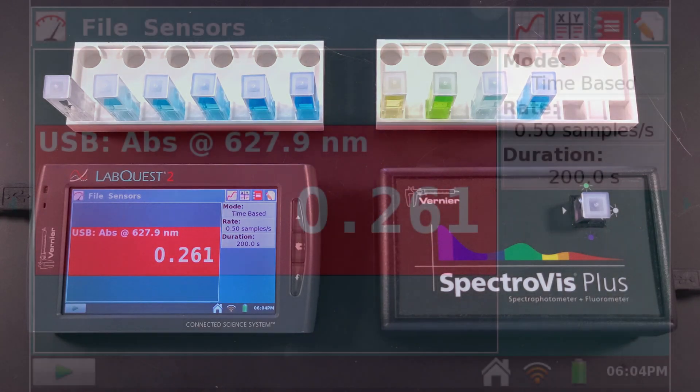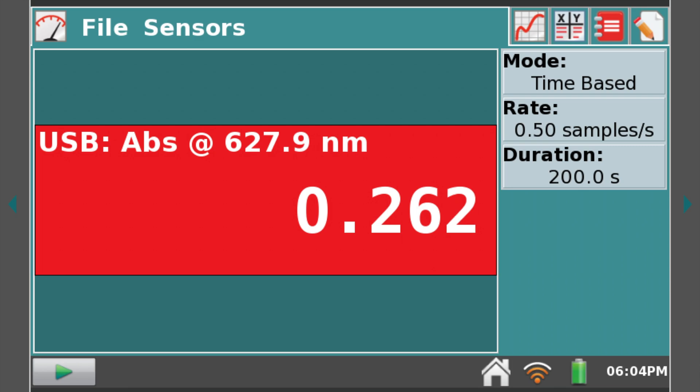Our fifth sample flavor of grape appears to have an absorbance of 0.261.